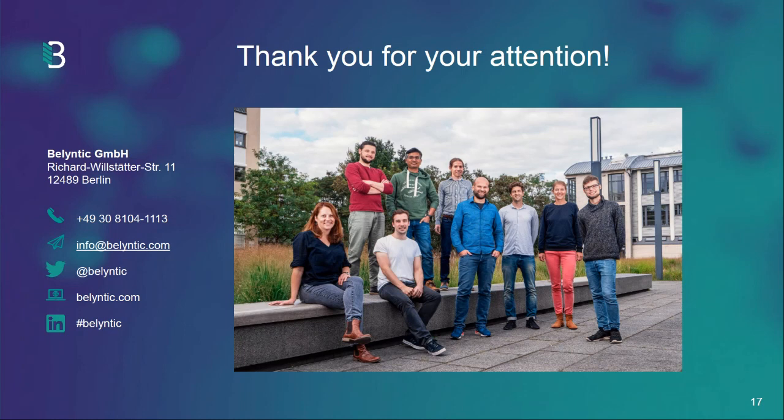No, not that I would. I think there is. I can answer this question, I guess. There is a possibility of imine formation, but we block the aldehydes by cysteine after the immobilization. So there will be no aldehyde present.